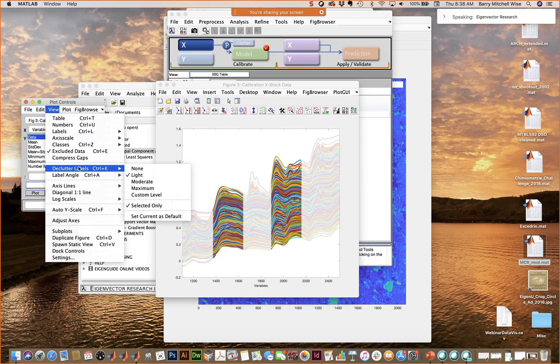I think there's a follow-up here. When you selected points to exclude, like you showed on the NIR data set, and you keep the labels on the data points the whole time so you can choose by the label. If I have a number of labels turned on, select one to exclude and the other numbers go away. And I can't tell which one to select next. Okay, I don't think I can answer that one in real time. I'd have to see what you mean on a real plot, I guess.